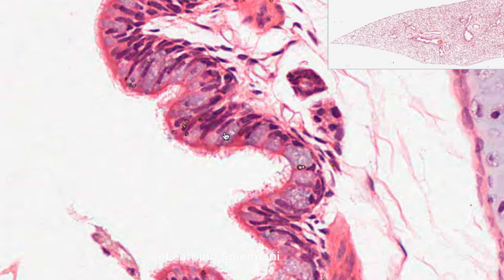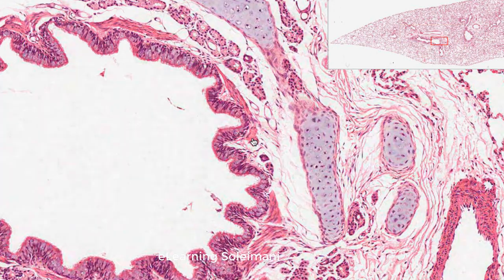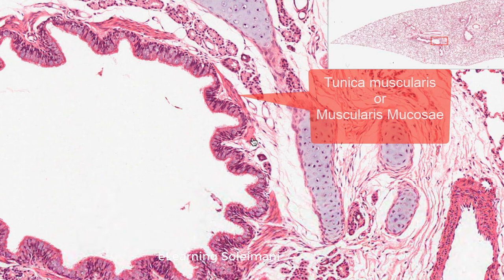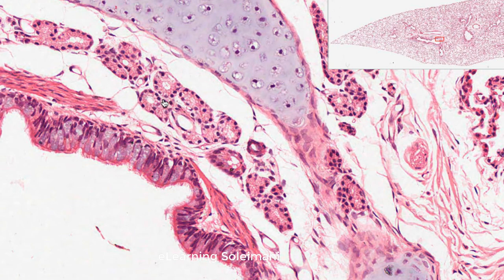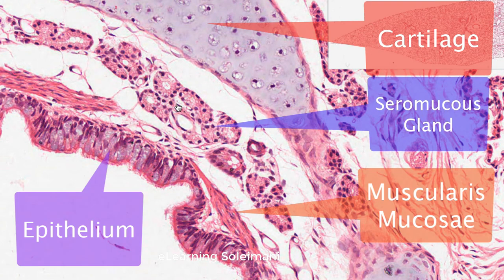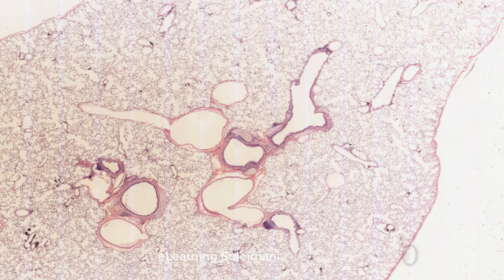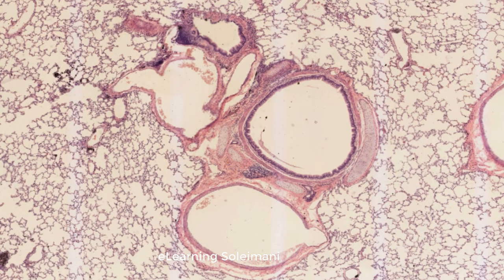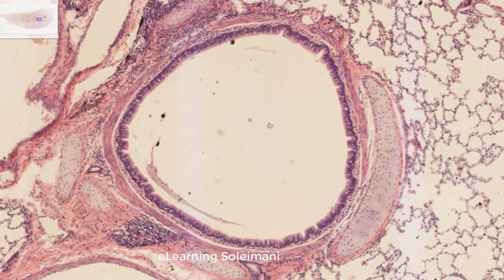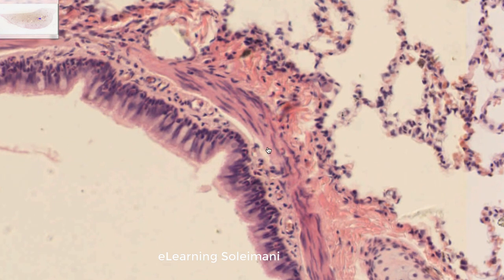Bronchi lined by pseudostratified ciliated epithelium differ from the trachea in having plates rather than rings of cartilage, and in having a layer of smooth muscle between the lamina propria and submucosa. In smaller branches, the amount of cartilage decreases, whereas the amount of smooth muscle increases. Also, the number of glands and goblet cells decreases.